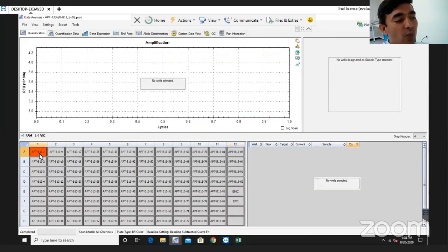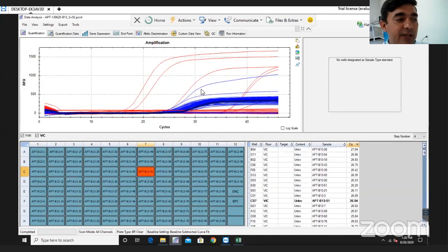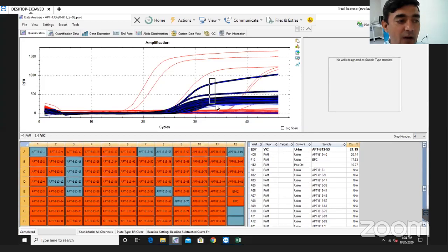Now, if we go to one particular sample or all of the samples, for example, if I'm looking for whether there are any flaws in the extraction process, any well where RNA is not successfully extracted, I just select all of these peaks over here, and it gives me the information that all of these samples highlighted in orange color are positive for the internal control extraction process, except these two samples.